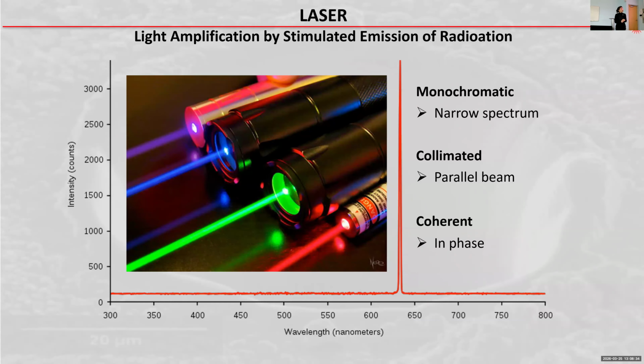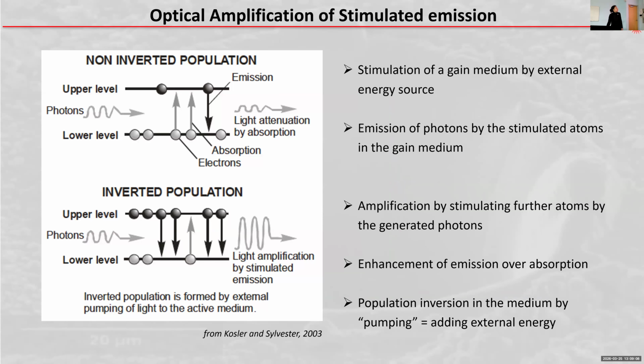It is based on a very narrow spectrum, with a very parallel beam, which is in phase. The beam is in phase, and everything the laser can do, and everything the laser basically is, is actually written in the name. It's Light Amplification by Stimulated Emission of Radiation. Some said in former times there was debate to call it "loser." It's anything but a loser. They wanted to replace the amplification by oscillation. But I am very happy they didn't go through with it.